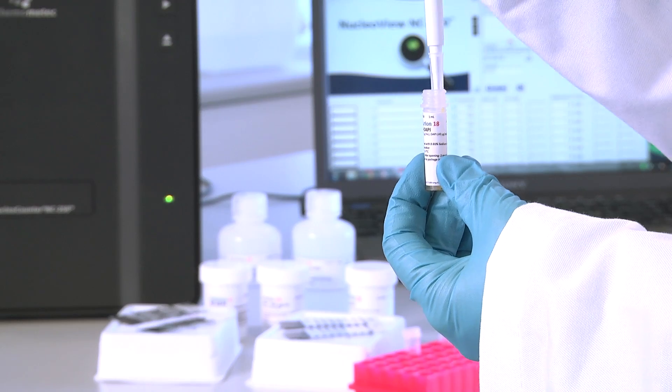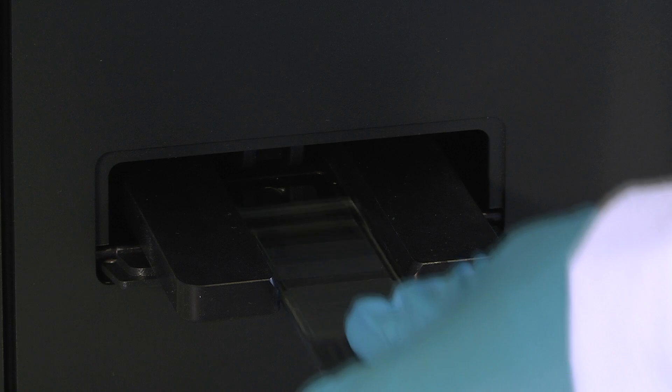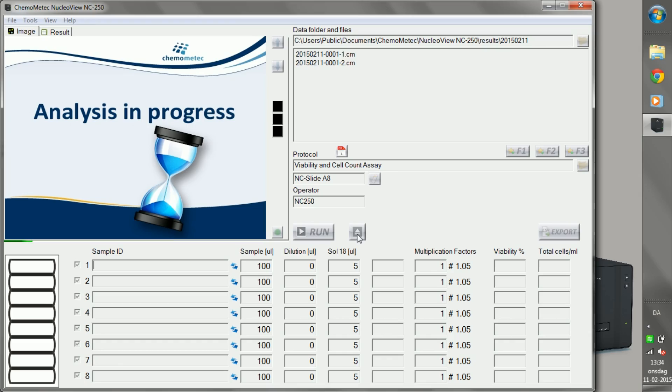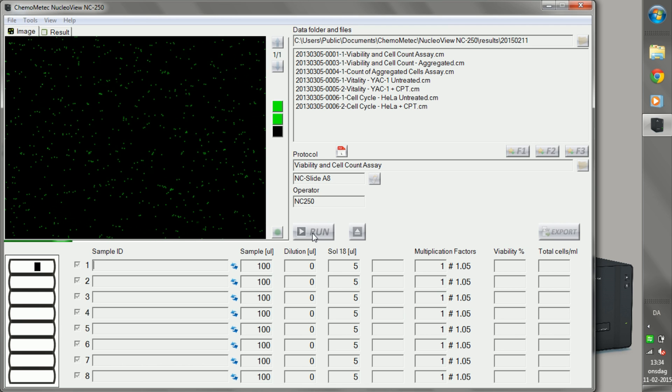Simply mix the dye solution with your cells, load the slide, insert and run. There's no maintenance, warm up, or calibration — just results every time, and fast.